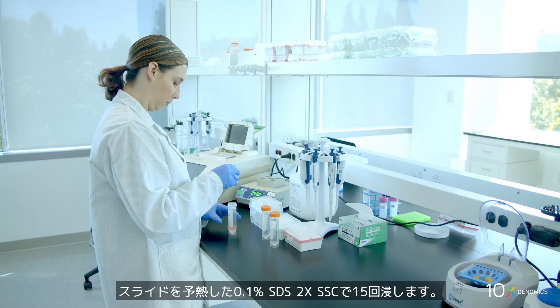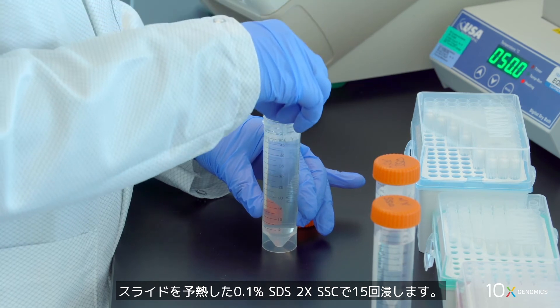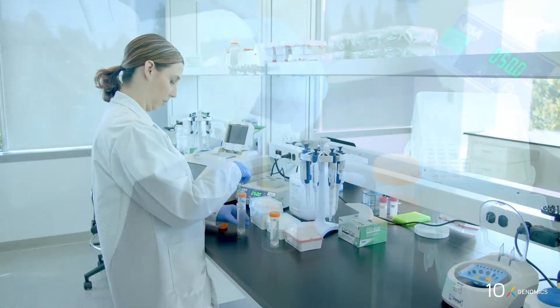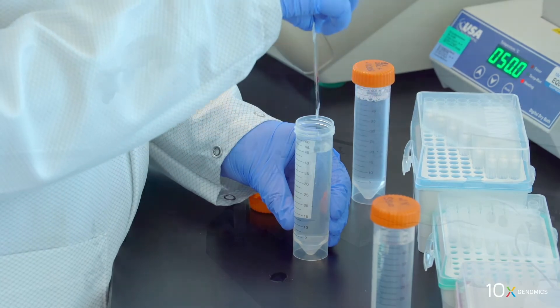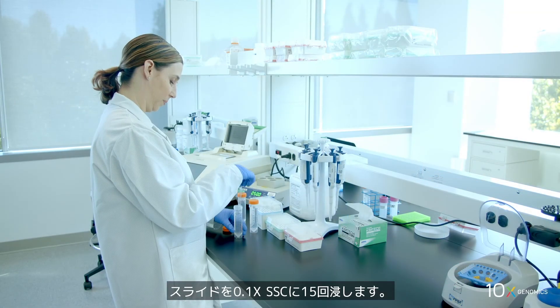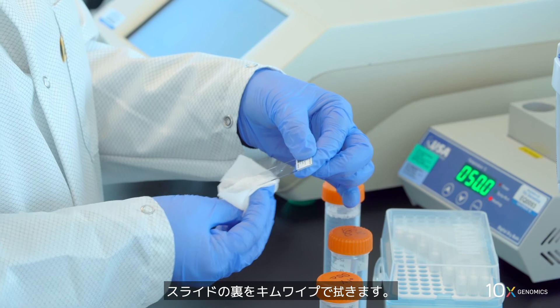Immerse the slide 15 times in the pre-warmed 2x SSC with 0.1% SDS. Immerse the slide 15 times in 0.2x SSC. Immerse the slide 15 times in 0.1x SSC. Wipe the back of the slide with a laboratory wipe.